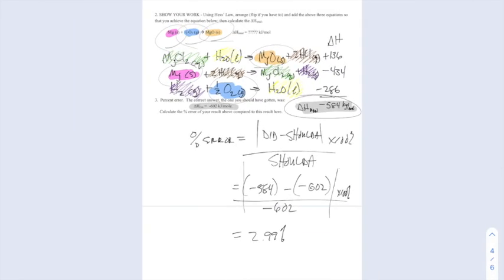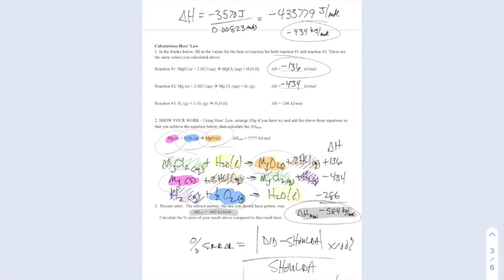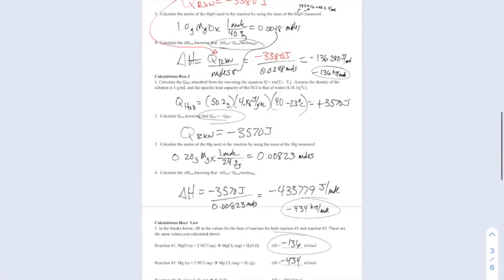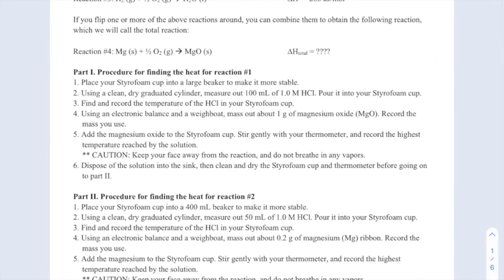That's pretty darn good. 97% accuracy, even with our assumptions and even with our high-tech styrofoam calorimeters. So this kind of combines a whole bunch of stuff that we learned in class. It's a great lab with fantastic results.